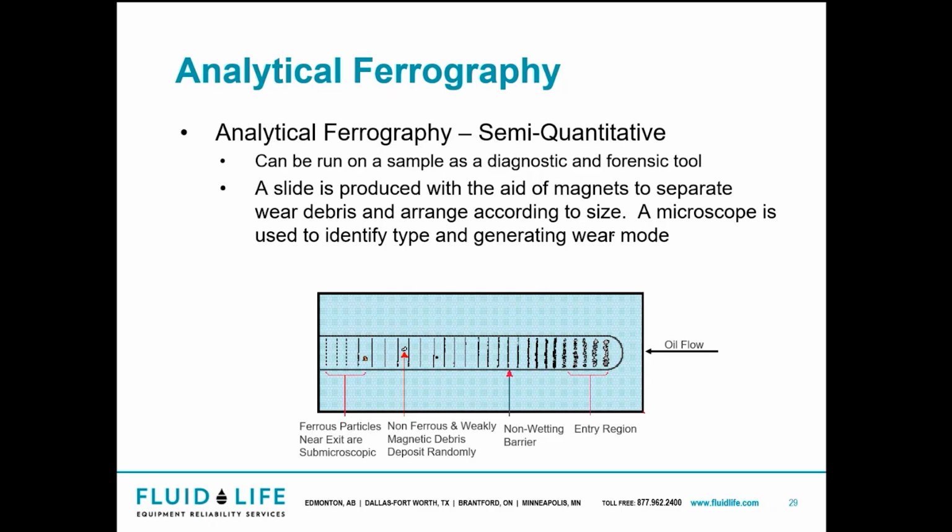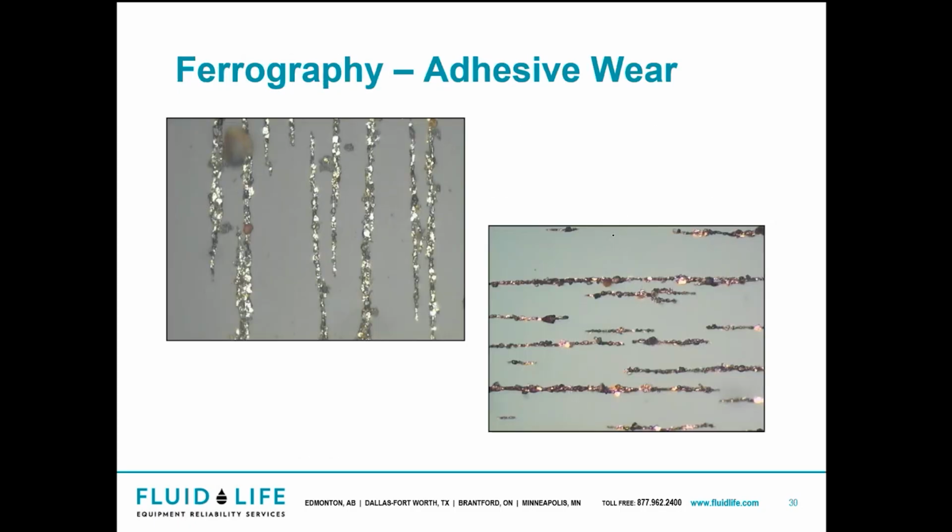So you're going to see different types of metal particles. Basically that's what it looks like. This is adhesion wear. Have you heard of adhesion, or have you heard of sticking, seizing, galling, smearing, any of that? It's essentially creating strings of metal in your oil. Now these are at a high magnification, so you may or may not actually see these particles with the naked eye. They would definitely not look like this. They might look like speckles or glitter in your oil.